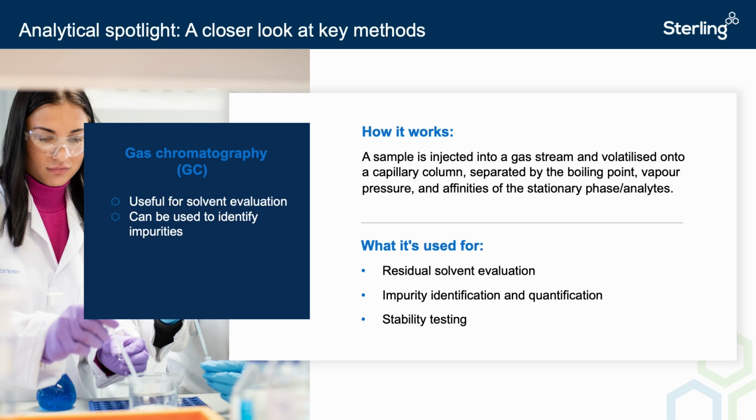This technique is mostly used for residual solvent analysis, but can also be used for impurities that aren't usually detectable on HPLC detectors. The method is also used to determine the purity of solvents used as raw materials in GMP production and are released using GC methods.